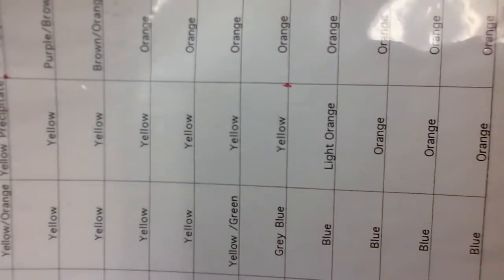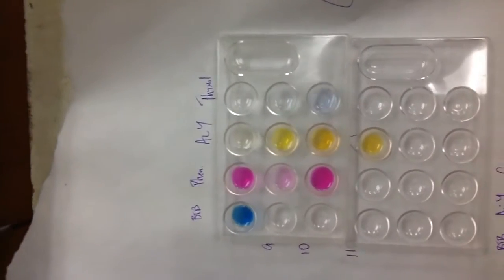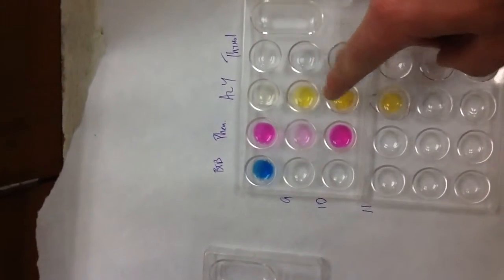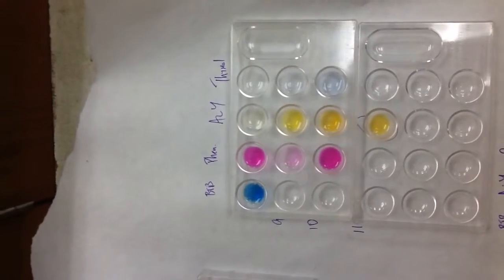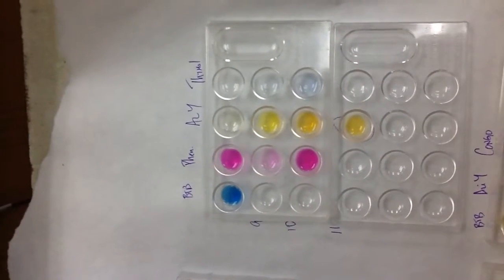Alizarin yellow, okay, this column here, as I go down, it shows some differences. I'll go over here between 10 and 13, and I wanted to see what color that would turn. My sample was a really light yellow. I think it may have faded just a little bit. And so I tested it, and this is 9, 10, and 11, also in alizarin yellow. I think it matched the pH 9 a little bit better. All right, or actually pH 10, I think.